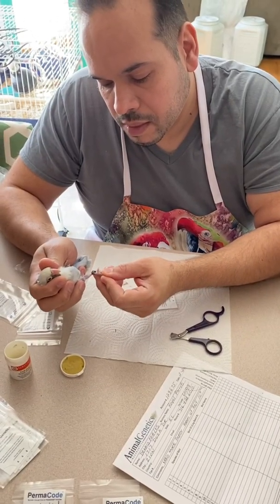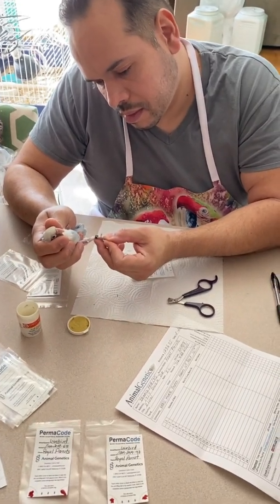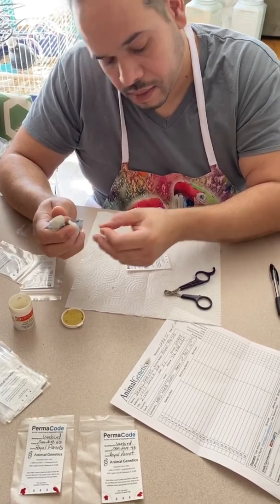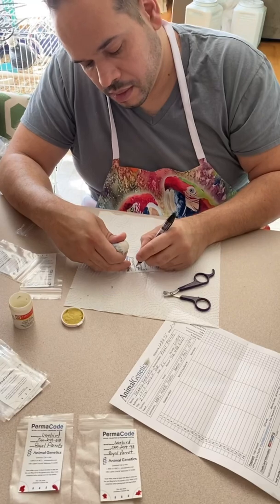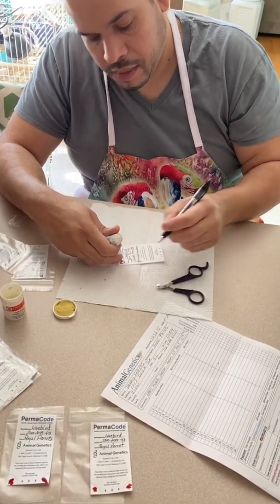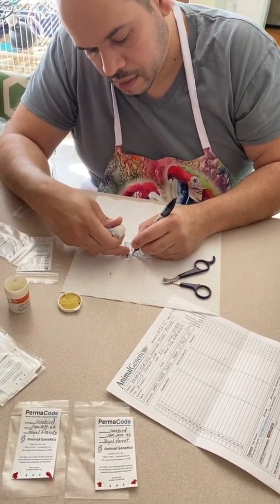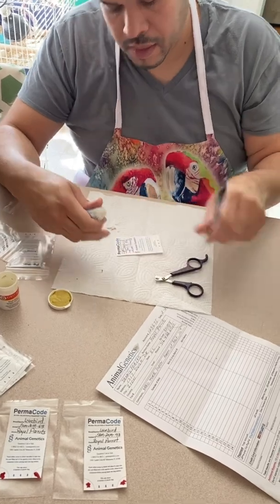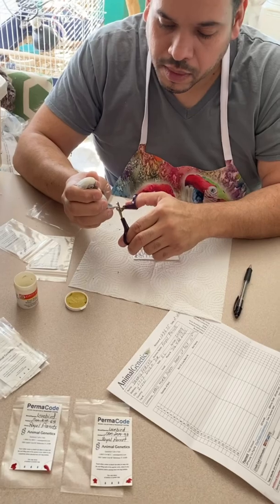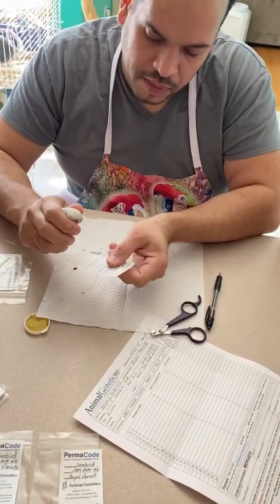Hi guys, Royal Parrots here. Today we're going to talk about how to DNA sex a bird with blood. A customer of ours asked us to do this video because this is actually a process that a customer themselves can do at home. There are a few things that can freak people out about DNA sexing a bird with blood, but today we're going to talk about how to do it at home and what those things are.